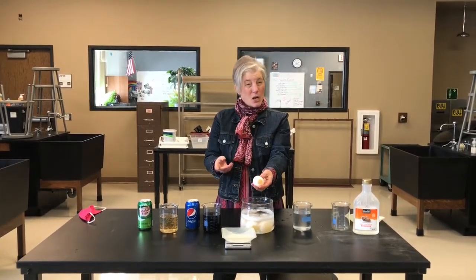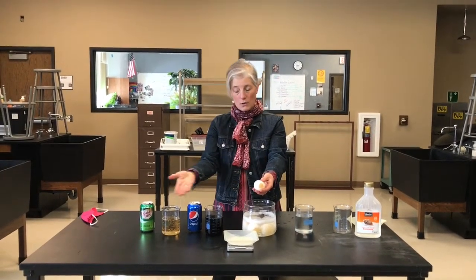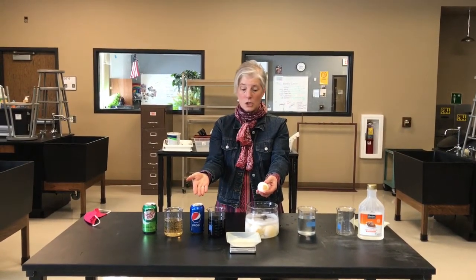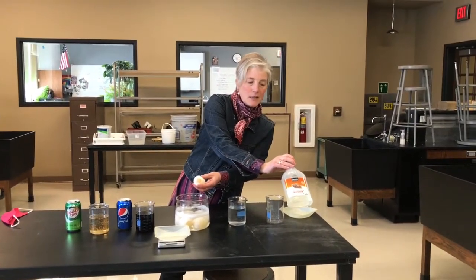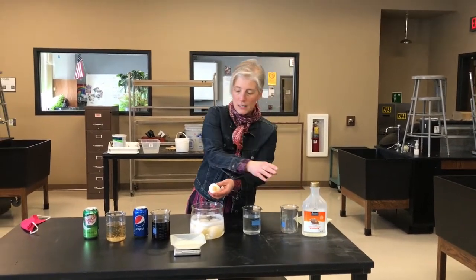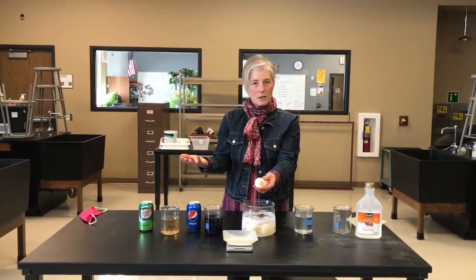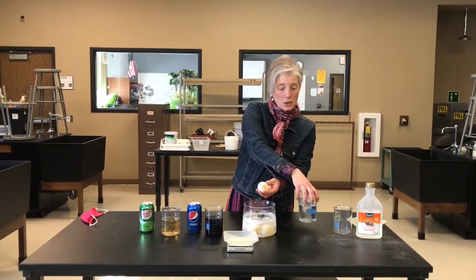Now, I will let you know, we're going to be using sugar. As you know, soda pop is full of sugar. And we're also going to use another form of sugar, corn syrup. Some of you might use it on pancakes, use it to make things that are very sweet and sugary. But of course we need a control. So we're also going to put the egg into plain water as a control.